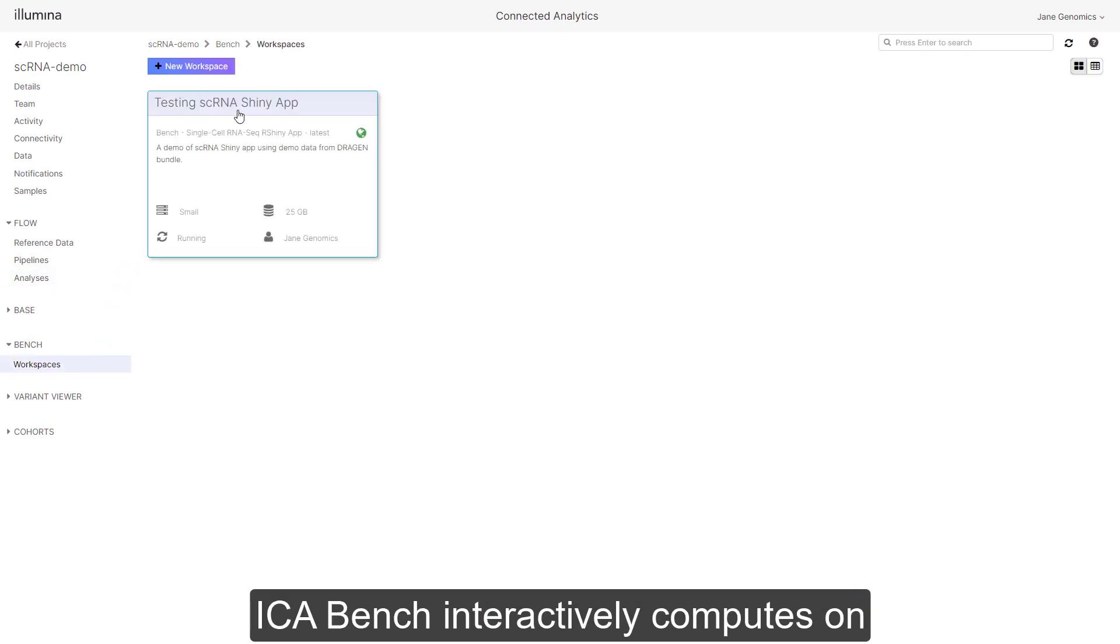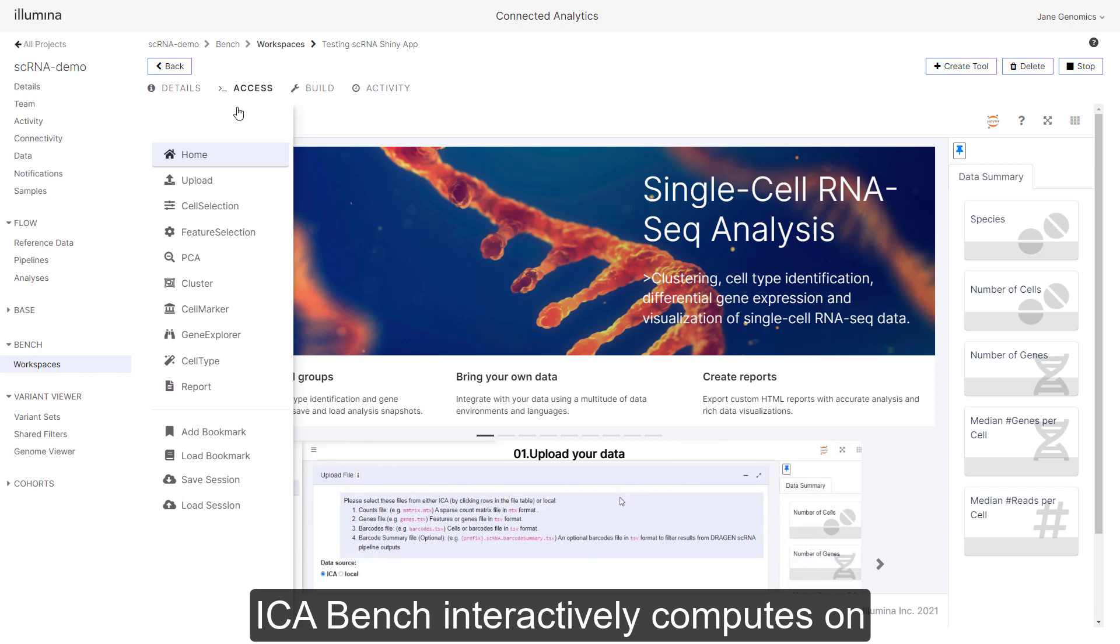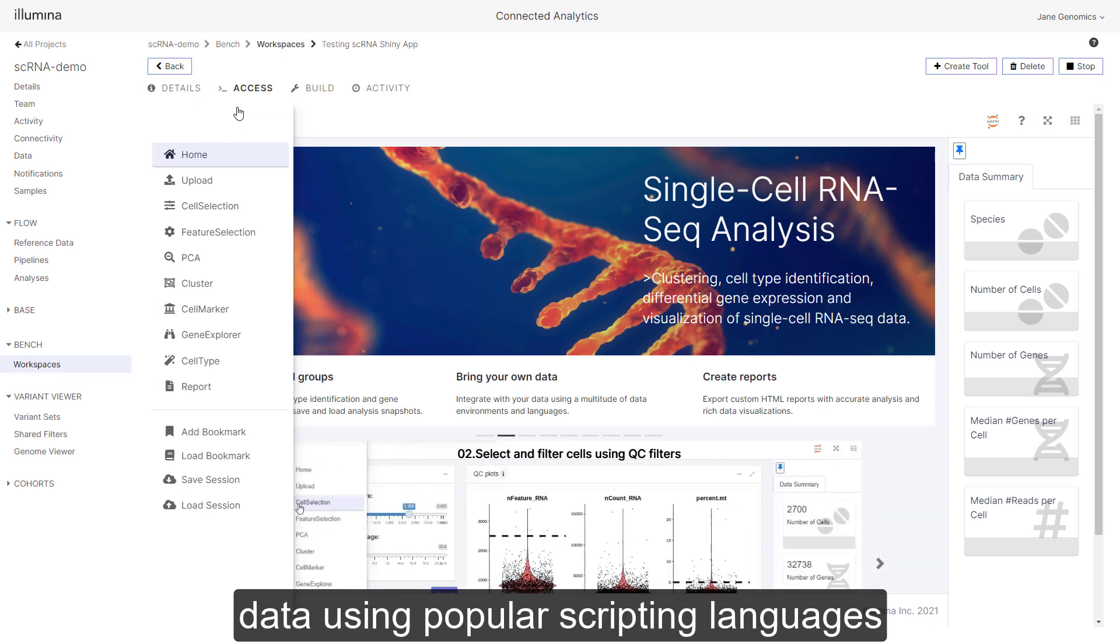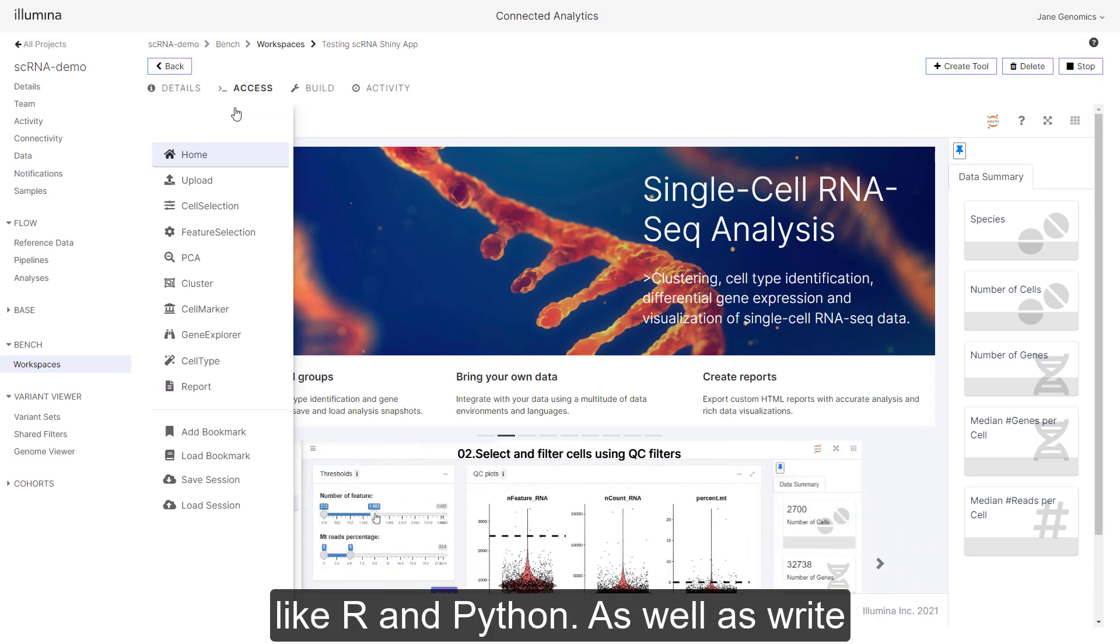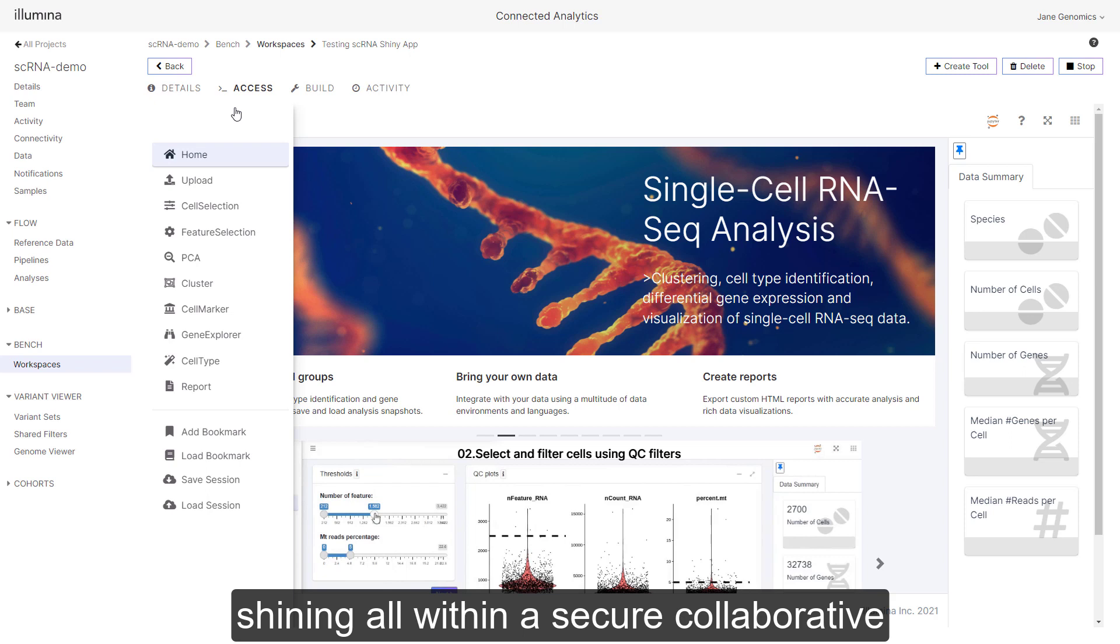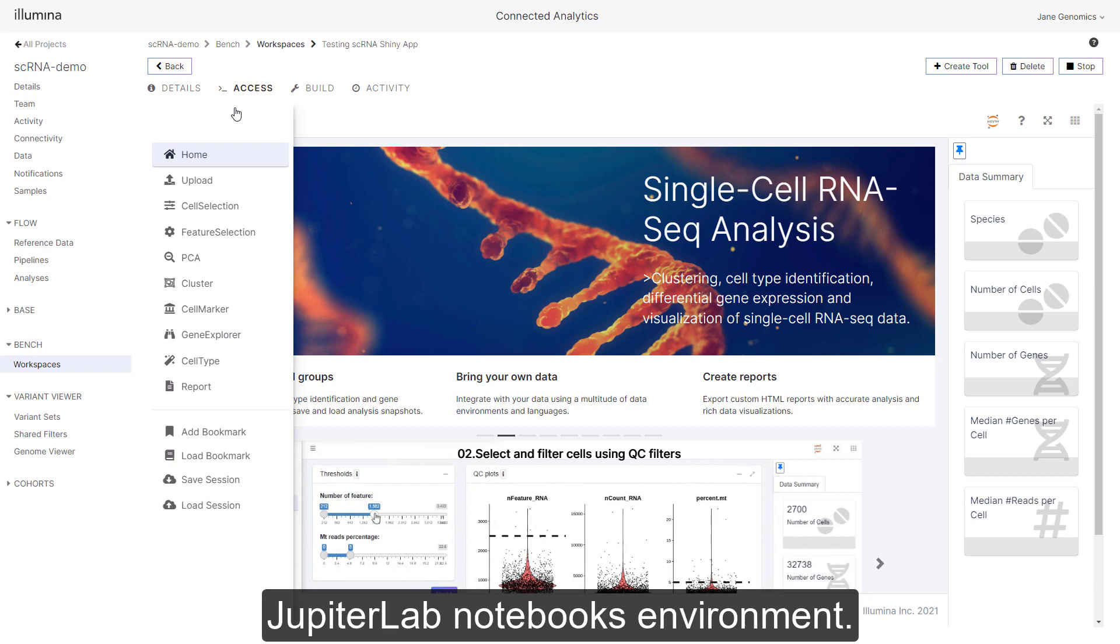ICA Bench interactively computes on data using popular scripting languages like R and Python, as well as write interactive graphical apps using R Shiny, all within a secure, collaborative Jupyter Lab Notebooks environment.